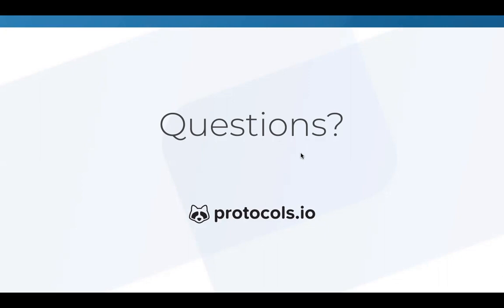Is it possible? Right, so for that, I think the fork functionality would be good. What I showed earlier, if you fork a protocol, you can copy the protocol and modify it to your needs, but it will always have a little note that says this protocol was forked from this and this protocol. So it always links back to the original protocol, but you can modify it so it fits whatever you're doing and your lab. Does that make sense? Yes, yes.